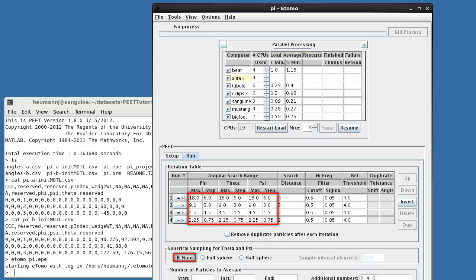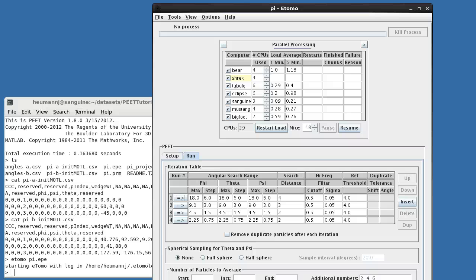Of course, with a dataset this small, speed is not really an issue, but it certainly can be when averaging thousands of particles. So now you've been introduced to the majority of PIAT's controls, and have seen how to use them on a simple dataset. In the following tutorials, we'll turn to real tomographic data, and we'll see how to handle some of the issues that arise there.